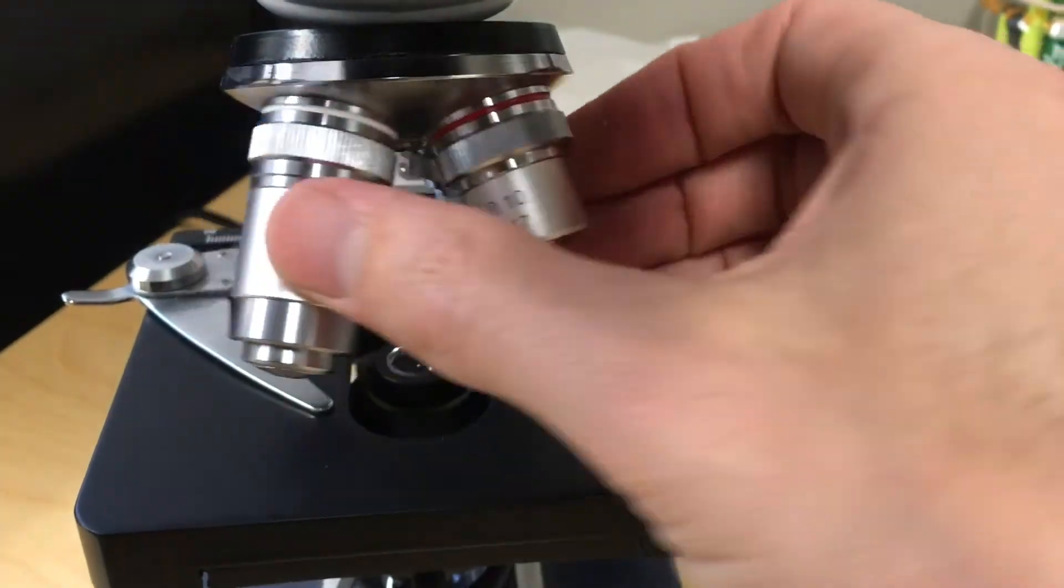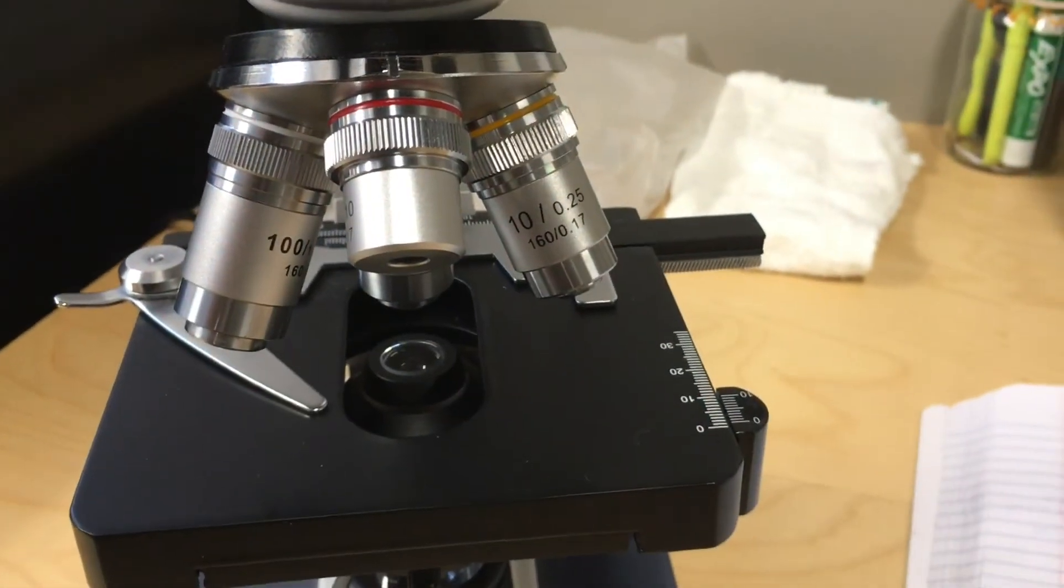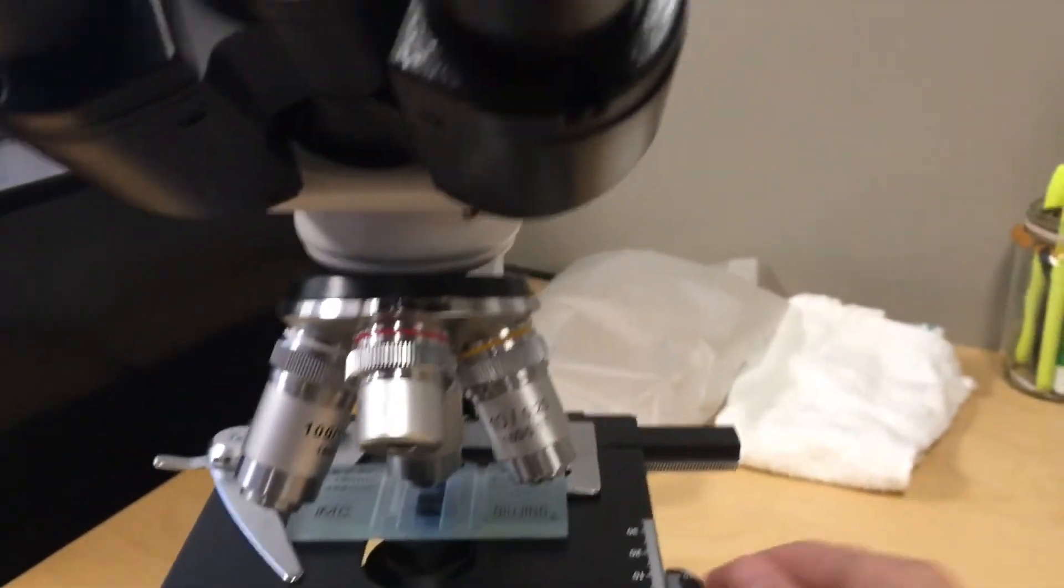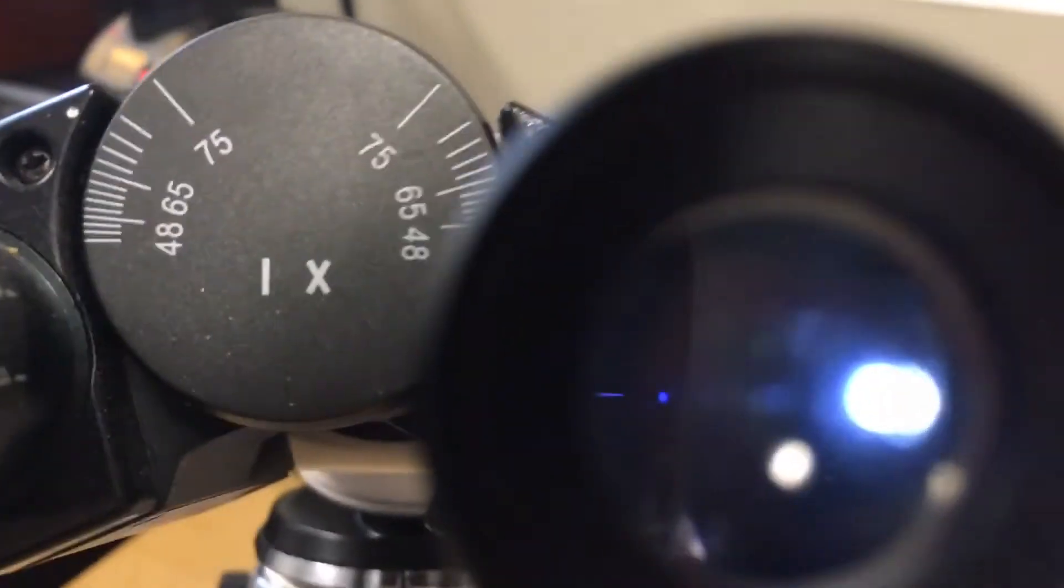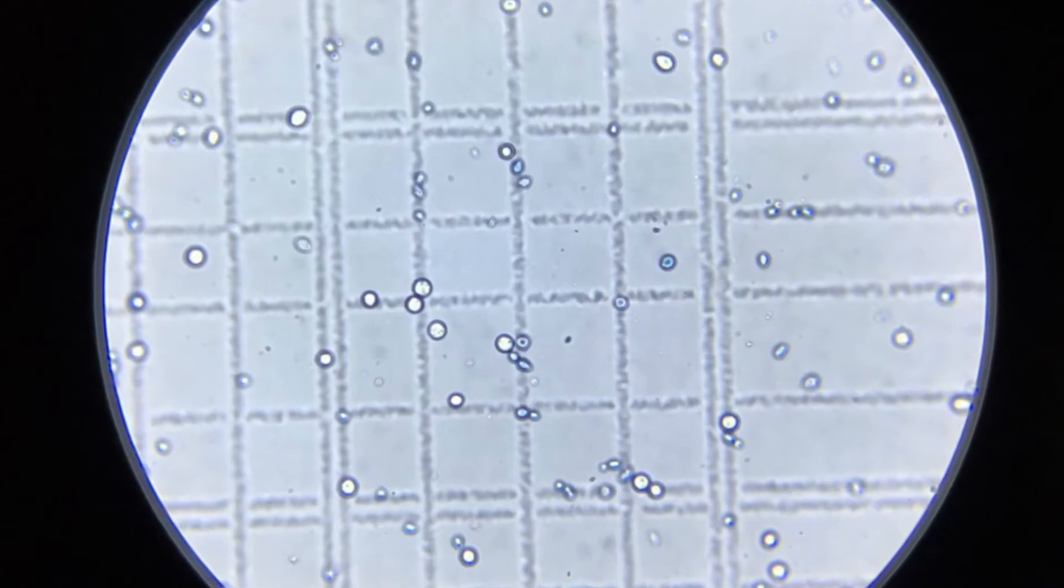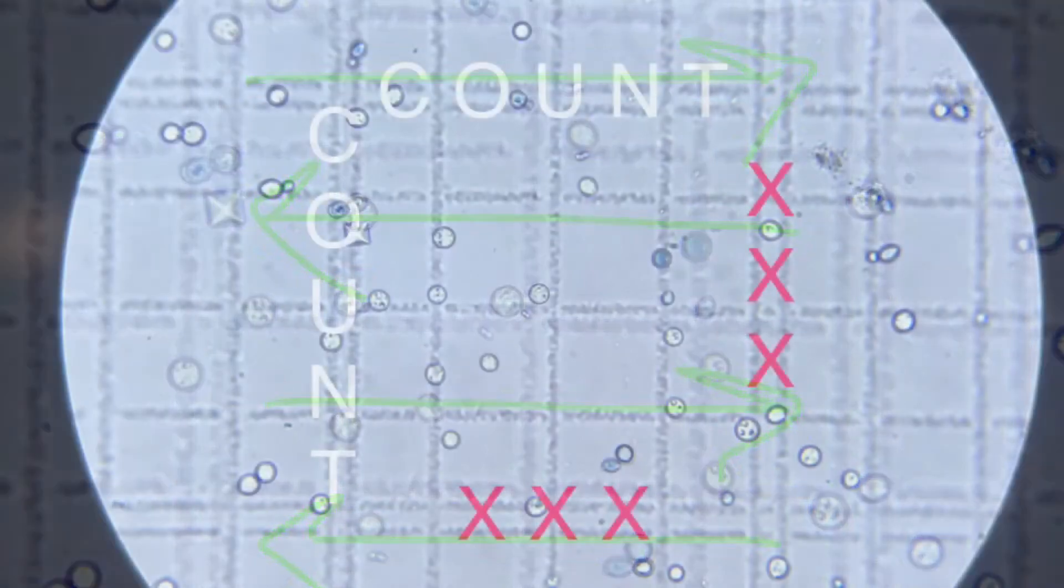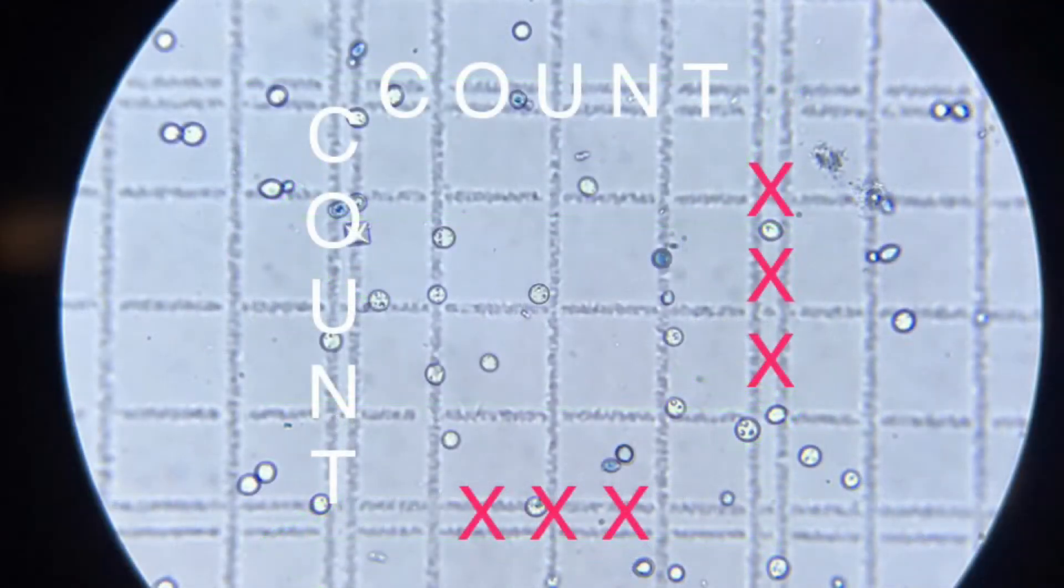Set your microscope to the 400x magnification to begin your count. You'll be counting five of the square grids that you see under the scope. Start in the upper left-hand corner for your first count. Use a consistent sweeping pattern for your count to ensure accuracy. You will only count cells touching two of the four sides. I use the upper and left sides.